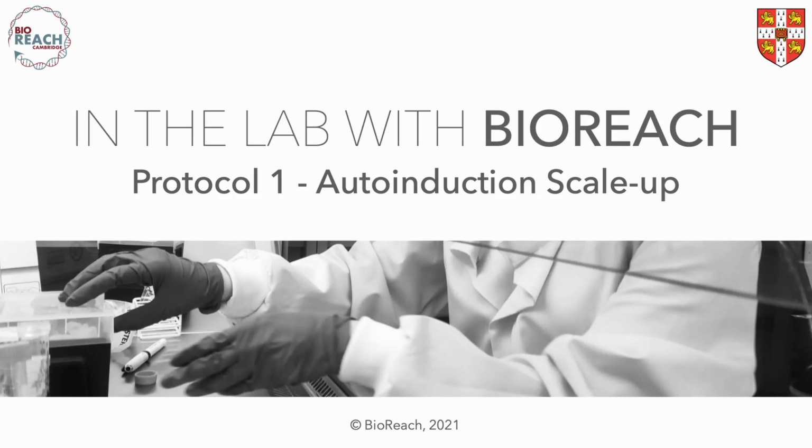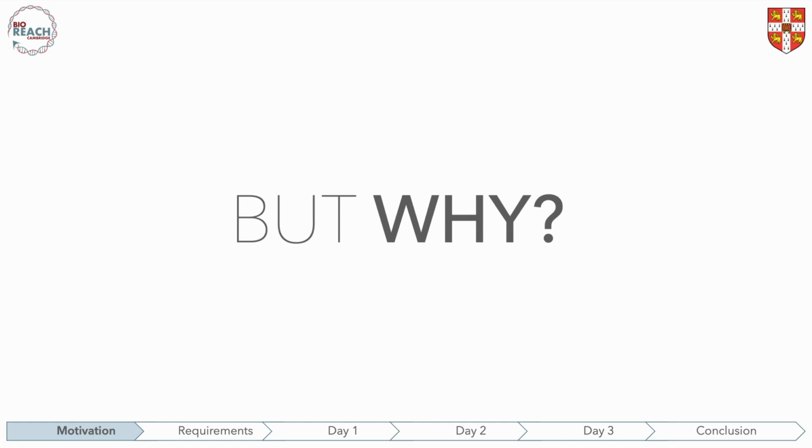Hello and welcome to In the Lab with Bioreach. Protocol 1: Autoinduction Scale-Up. This video will serve as a helpful visual guide to the written protocol available for download on the Bioreach Cambridge website. Why do we need a protocol for autoinduction scale-up?